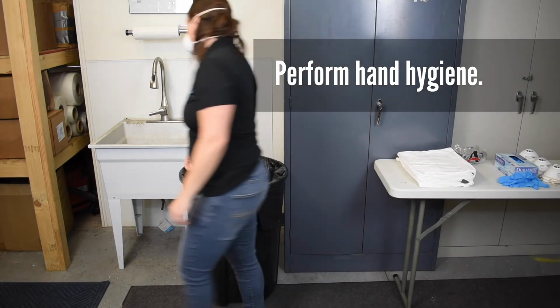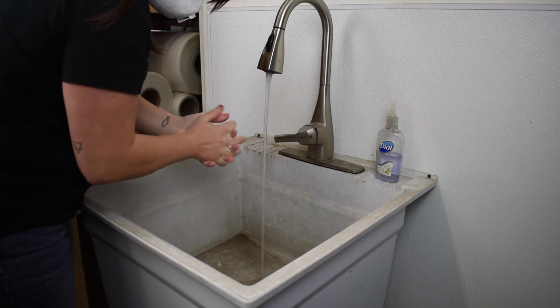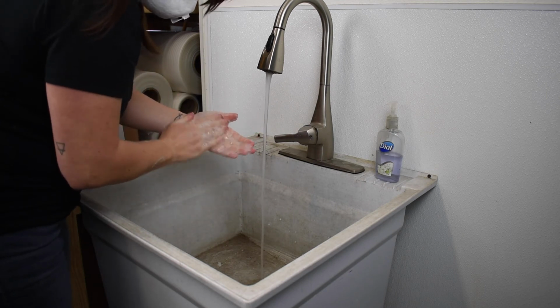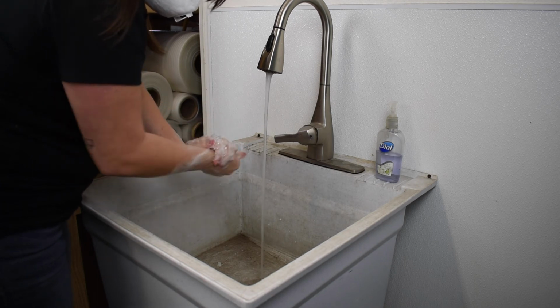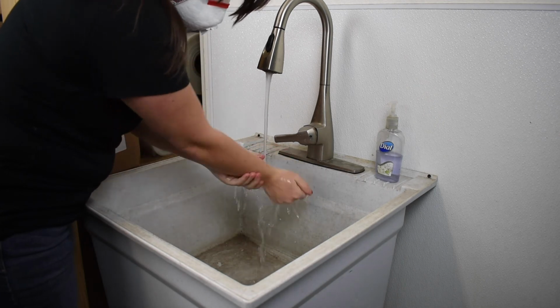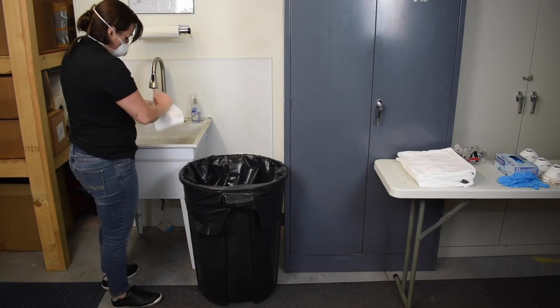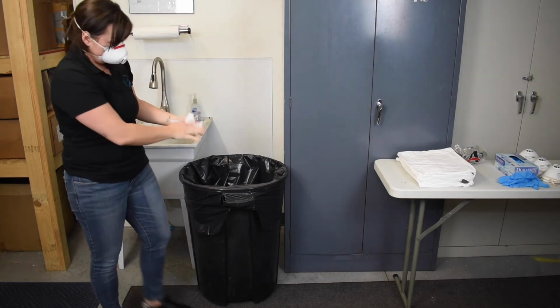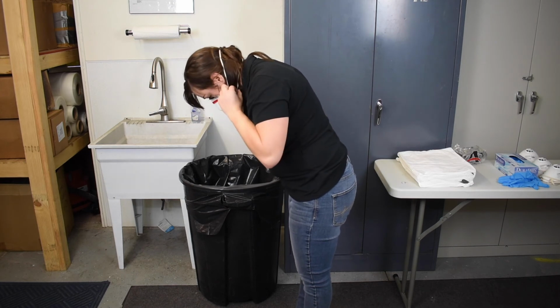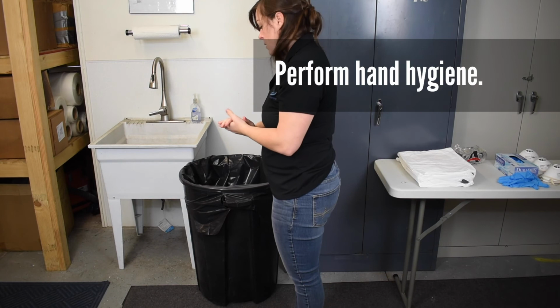Perform hand hygiene. Next, remove your N95 respirator by tilting your head slightly forward and grasping first the bottom elastic band and then the top elastic band, and remove without touching the front. Perform hand hygiene.